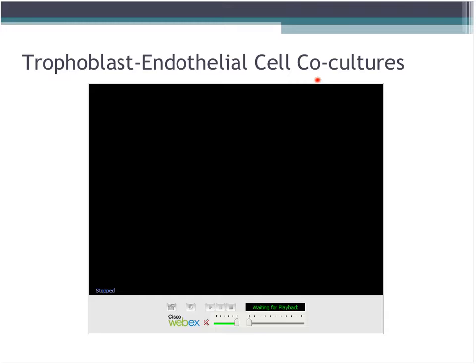Okay, I think most of you have got it now. So you can see the cells move about in culture with each other. You can see instances of apoptosis, such as where you get that bright membrane blebbing. This is actually run under 0.5 dyne per centimetre of shear stress. So not a massive amount of shear stress is flowing through there, which is why you see various instances of apoptosis.